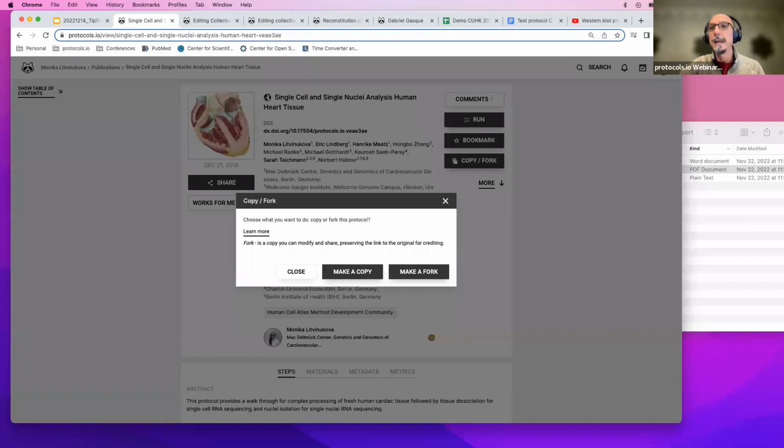Okay, then let me say, Grigor asked, if you place a video and YouTube removes it from the channel, does the video stay in the protocol? No. If the video is removed from the channel, from YouTube, it will be removed from the protocol. The protocol will have a link, but it will be broken.